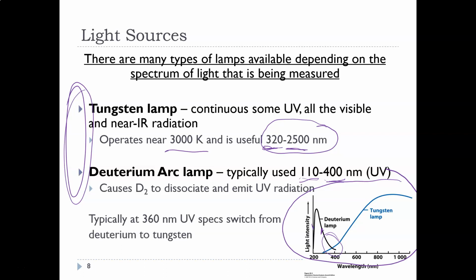The instrument that we had before the one we have right now was exactly this setup. There were two little buttons that I could have manually turned, the tungsten lamp on or the deuterium lamp on, but I typically let the computer decide. I just set the wavelength and it decided which one was best. Deuterium is hydrogen 2, so it's got H2, but where both atoms are the isotope, where each hydrogen has an extra neutron.